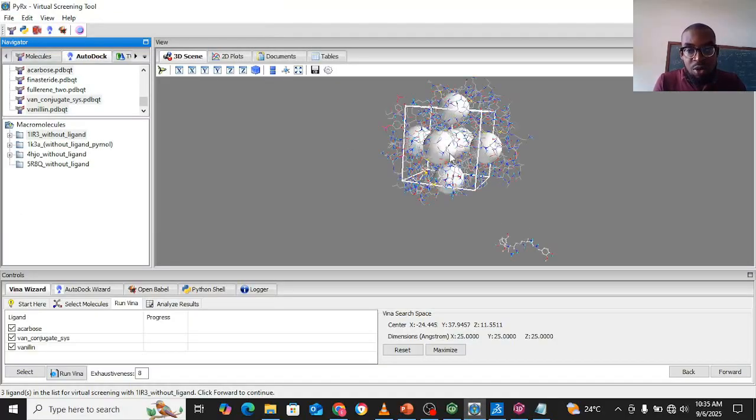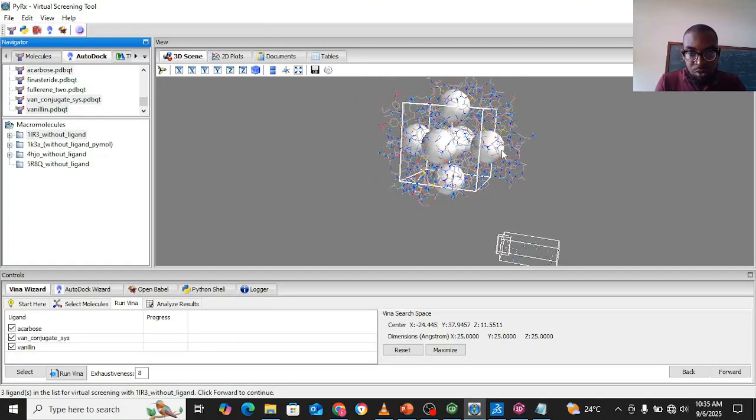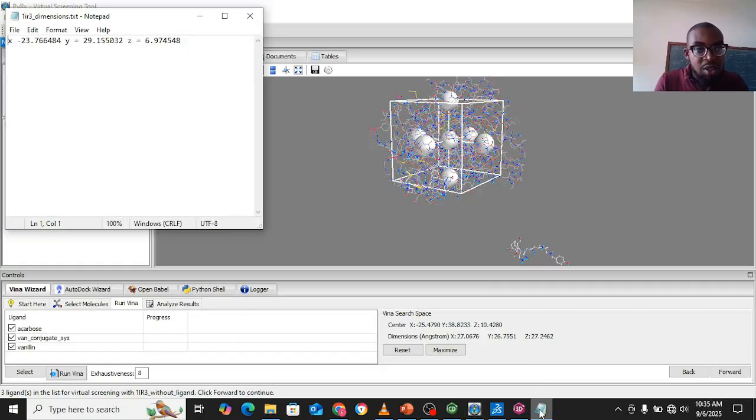Now this is your x-axis, this is your y, and this is your z behind. So for x, it is minus 23.76. So let's do that.